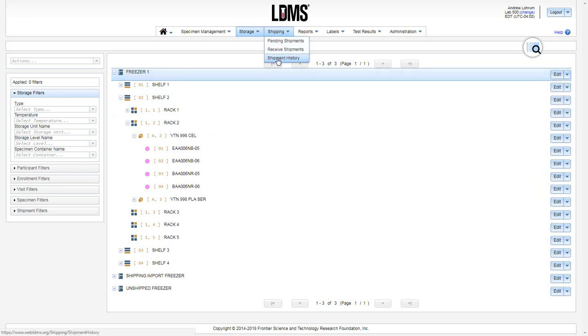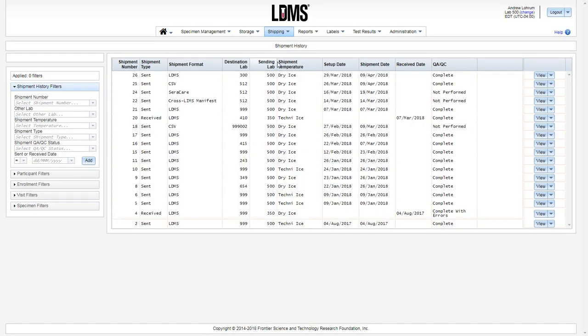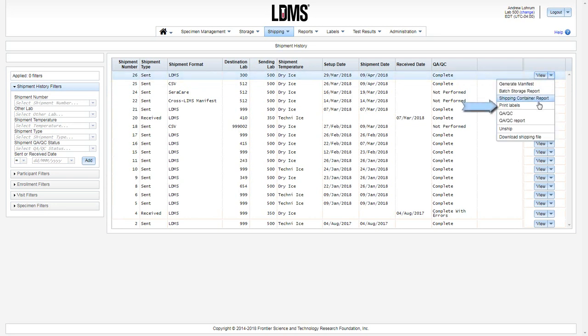In the shipment history page, you can reprint the labels for all the specimens belonging to a batch by using the drop-down menu for that particular shipment and clicking print labels.